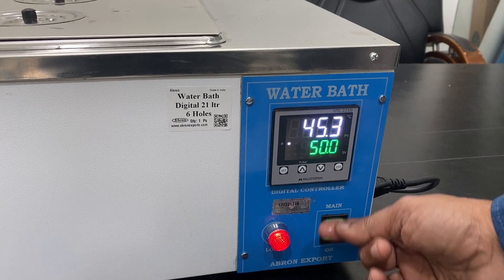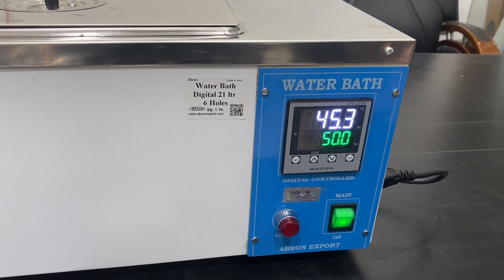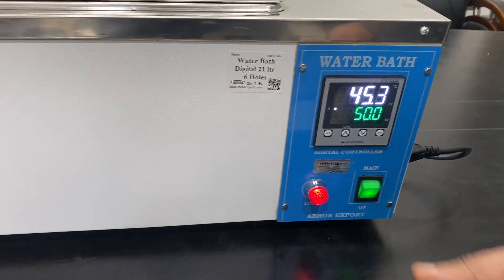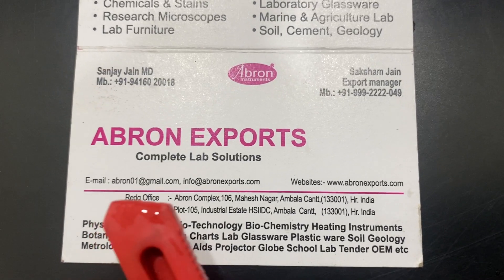Now the heating has become slow. This is approximately a 1750 watt heater, and one ampere is the current that will be used. Please visit the website, and we also have an email at abron01@gmail.com — you can write us an email there.